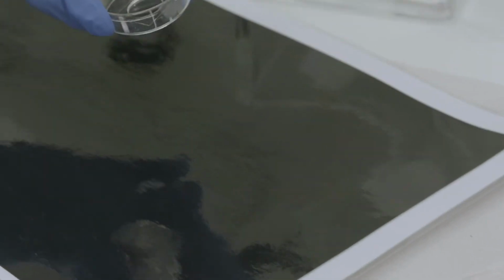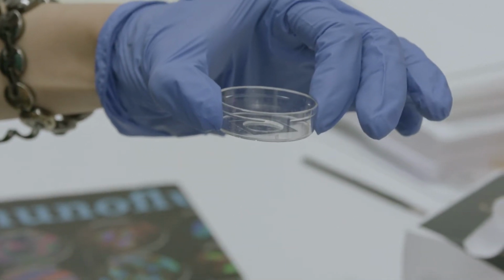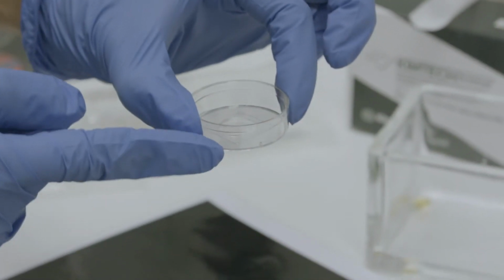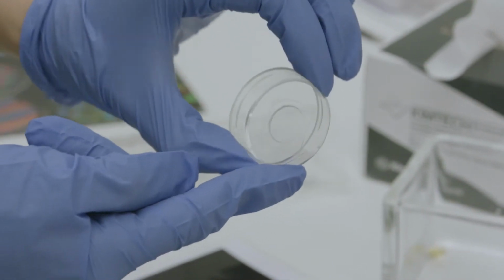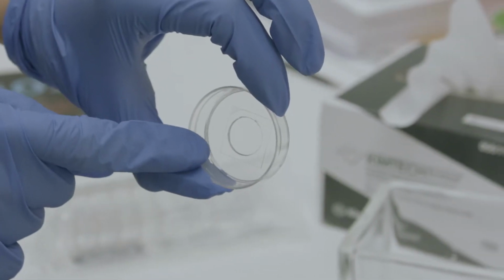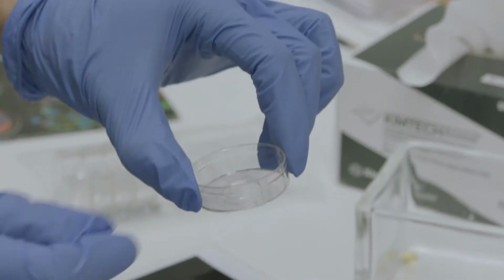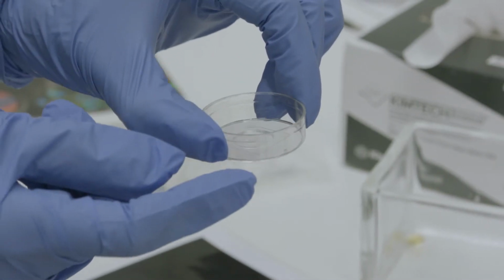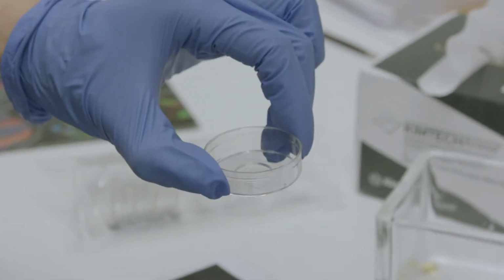Exactly. If we have an inverted microscope, where the objective is coming from bottom to top to image your sample, then we come up with a quite simple solution. So these are glass bottom dishes. You can see that it is a Petri dish made of plastic, and in the middle there is a cover slip made of glass. In this way, you can put your sample exactly in the middle where the BABB is, so it will not melt the plastic. You just have to be very careful when putting the BABB. And then later you can simply go to the microscope.